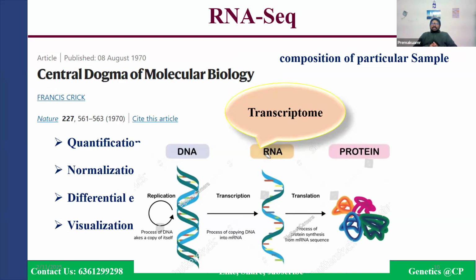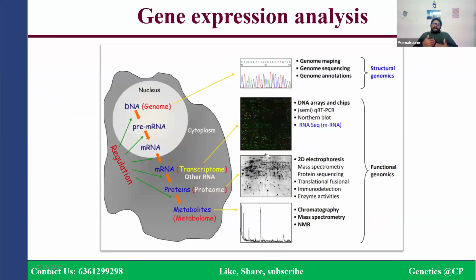Within a cell also, at different sites there will be different RNA. That is coming nowadays as single cell transcriptomics. But today we are going to discuss only the bulk transcriptome, the entire transcriptome of the overall cells.